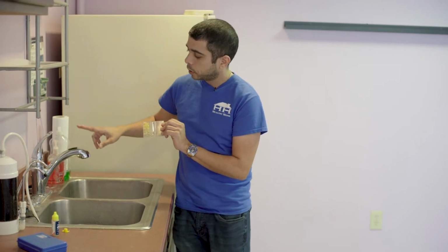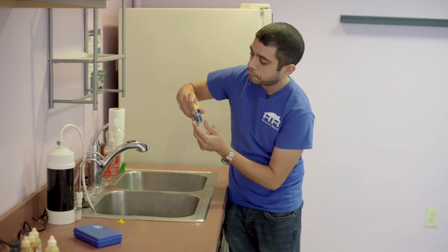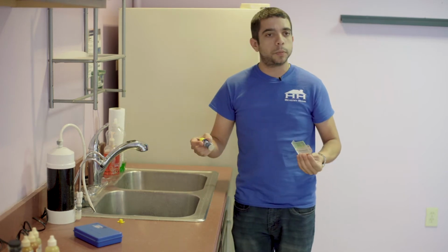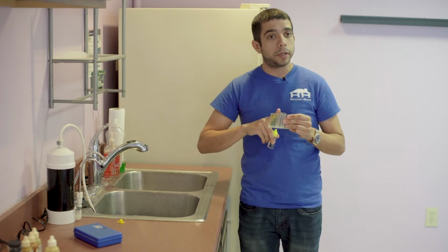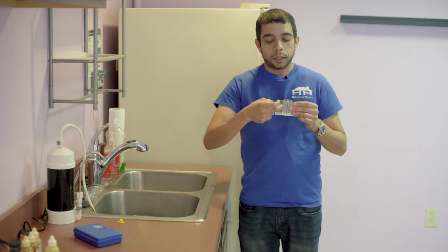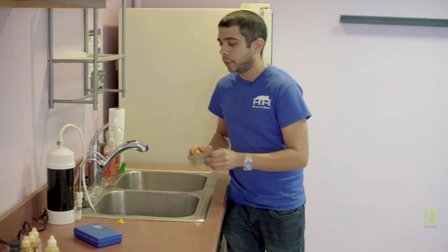We're going to fill this up using tap water from your faucet, because no one ever thinks to test their tap water with a pool test kit, but we're going to do that. Then we're going to add 5 drops of OTO and color it up. Anyone with a pool test knows once you add the 5 drops, you wait a minute or so, it'll turn yellow, if not immediately, and then you just figure out how strong it is. It's very simple, very basic, and easy to understand.